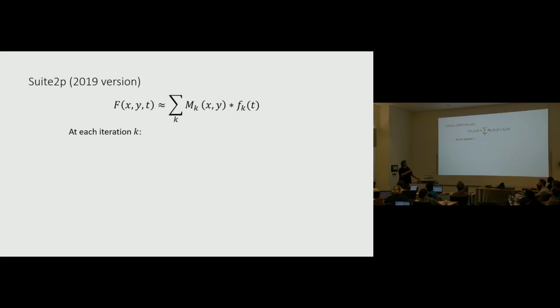So we know we're trying to solve a matrix factorization problem of this sort. M are the masks for each cell, F are the activity traces, and we're doing this iteratively. At every iteration, K, first thing we have to do is find a new candidate cell. We look for blobs of cells, localized blobs of pixels, that have large relative transients. What I mean by that is they have large total activity in this set of 10, 20 pixels nearby on at least one frame, right?